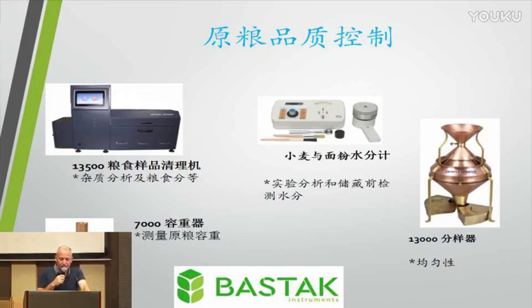Sample cleaner: impurity analysis, grain classification, moisture, grain and flour together. It is important to check moisture before laboratory analysis and storage conditions, of course. Sample divider: you can use it for homogeneity. Hectoliter, density measurement: you can use it to control the density of the grain.